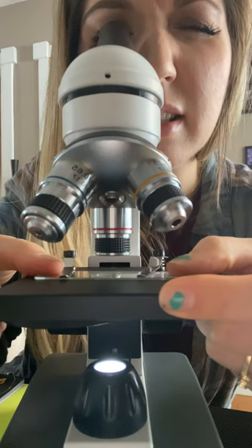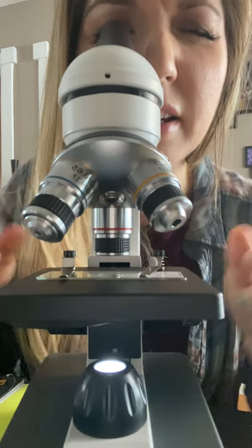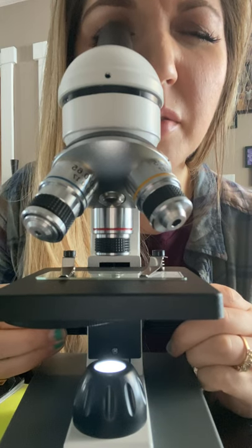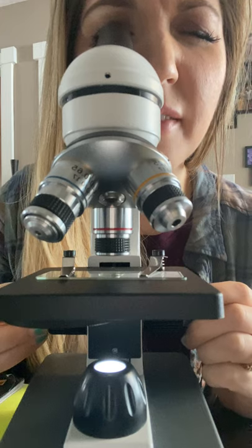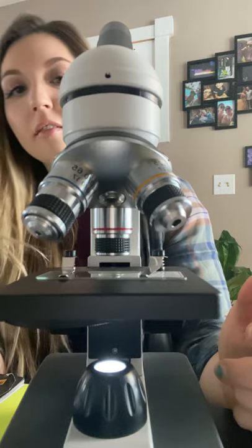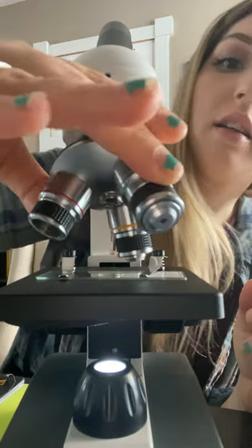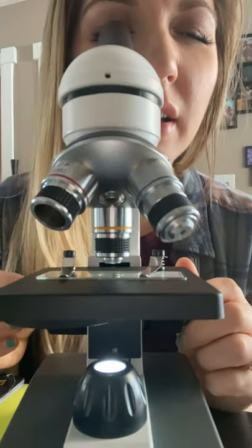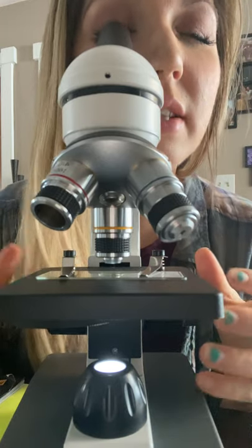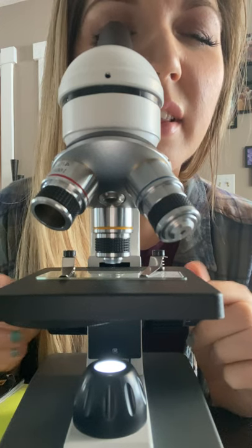Now I'm going to slide it under so it's clearly in view, right about there. One more adjustment using the fine adjustment knob to get a really nice image — got it! Now we're going to go over to 100 times magnification. From here I can see the slide; I don't need to adjust with the coarse knob but I am going to fine-tune it to get it nice and crisp. There we go.